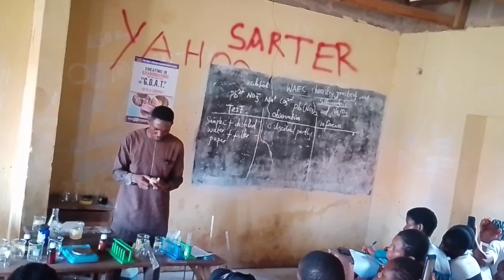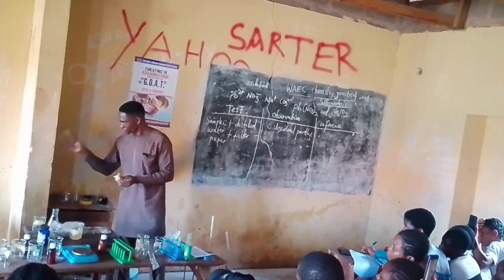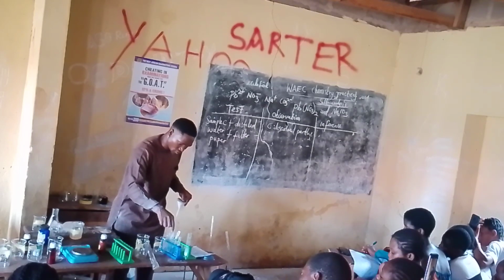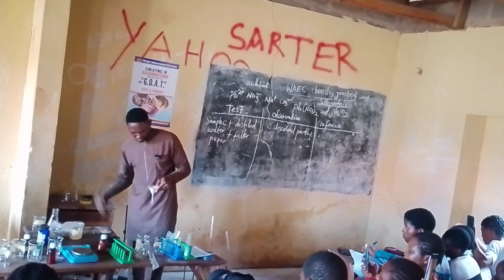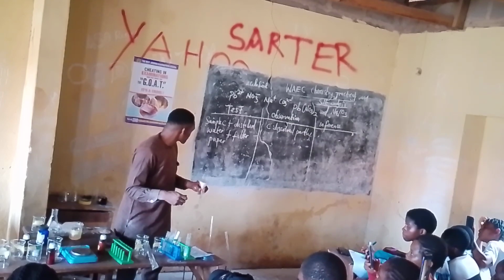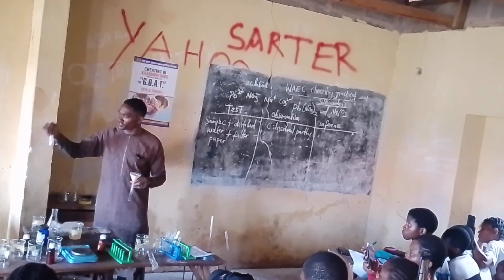And then open one of the corners. Look for your funnel. I will get one of these test tubes. So this is sample C plus distilled water plus filter paper.